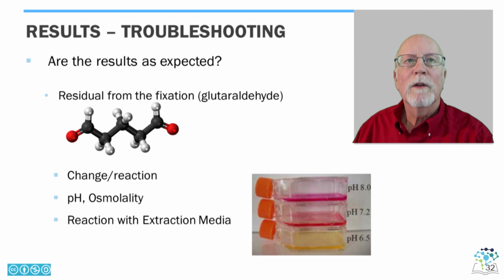Also, when devices are processed for extraction, it's common for the device to be cut into pieces. Occasionally, internal components such as wires, circuits, or connectors, which should be shielded by the construction of the system or by special coatings, may accidentally become exposed to the conditions of the extraction solvent and could lead to test failure. This is one example of improper extraction.